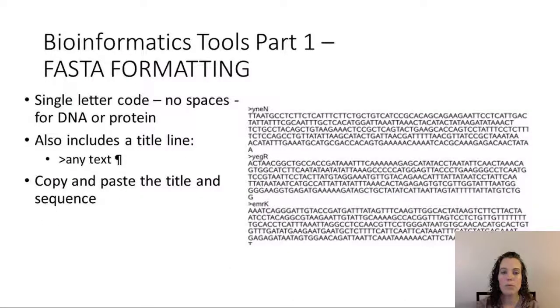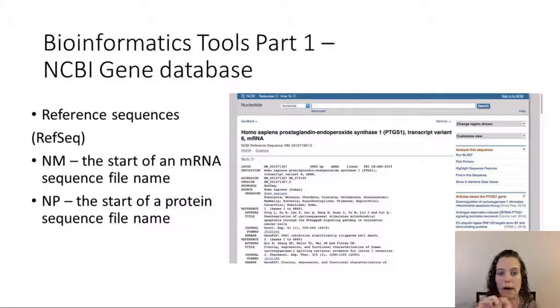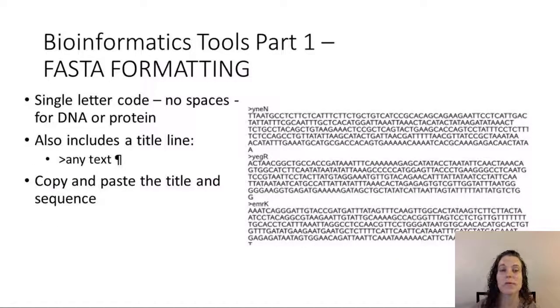The next thing we will do is to collect the FASTA formatted sequence. From that original page, you have a FASTA link. It's right below the NCBI, right below the name. That opens up another page that has the FASTA sequence. The sequence is formatted in a specific format that's recognized by most bioinformatics tools.